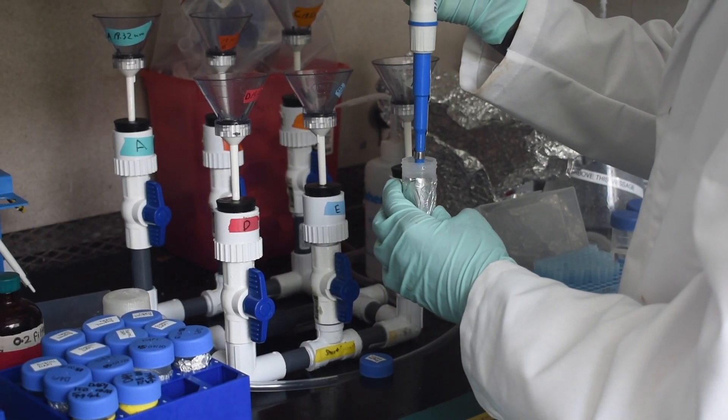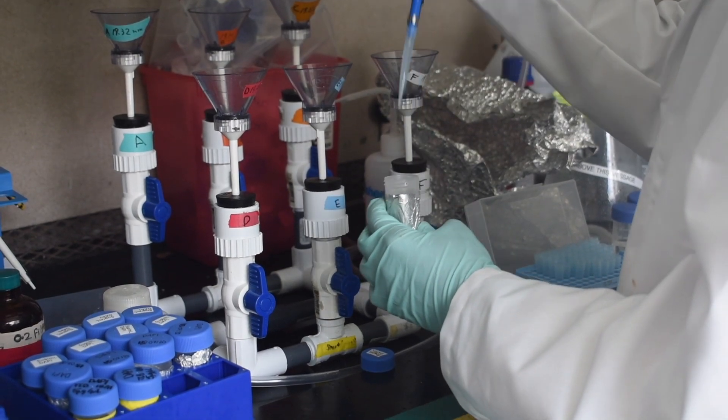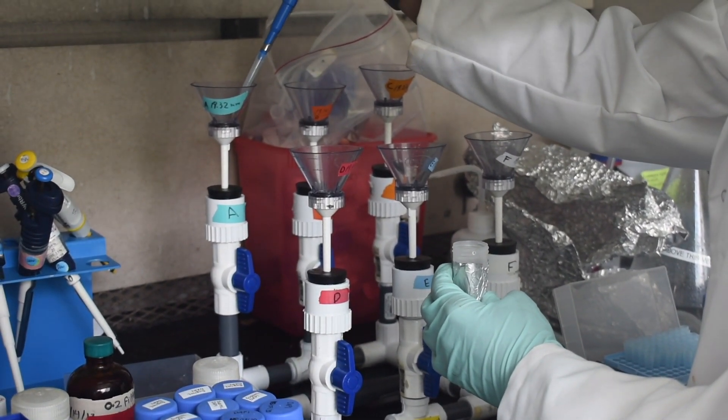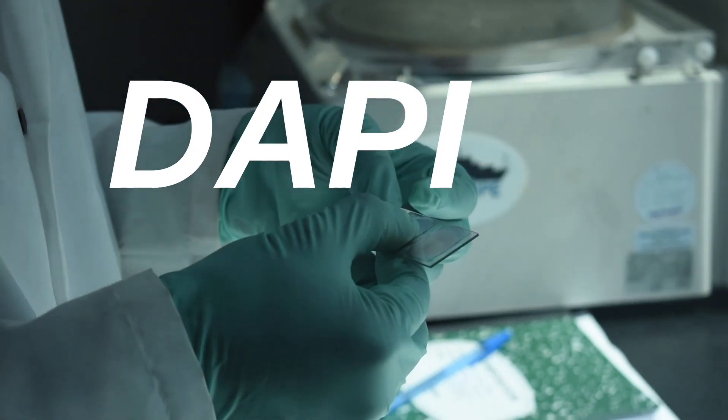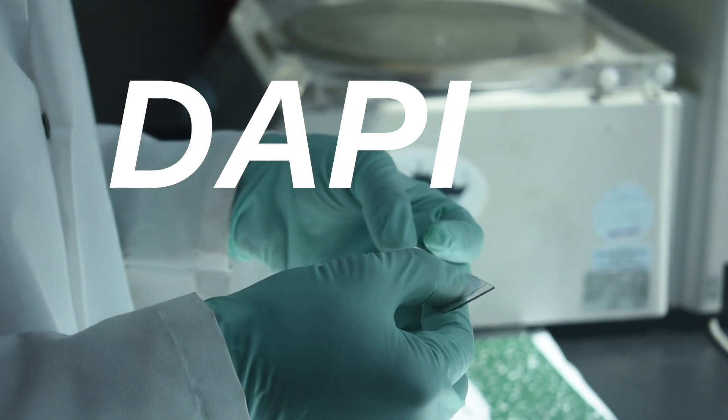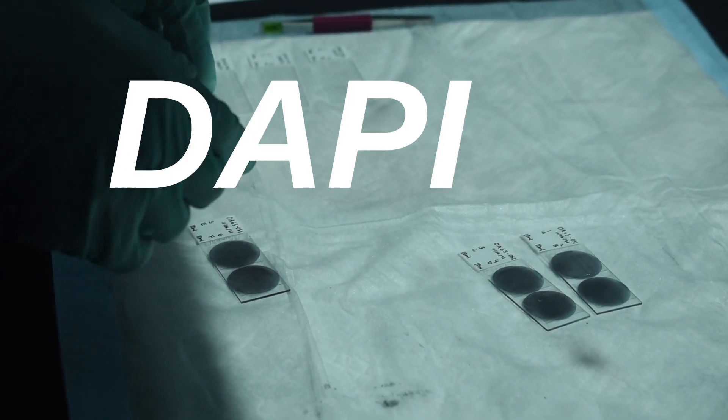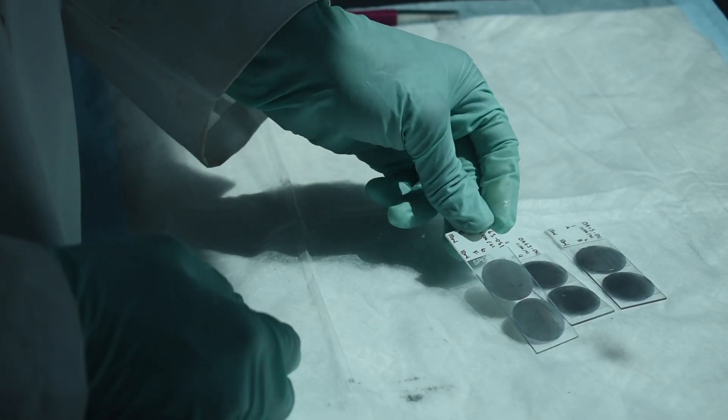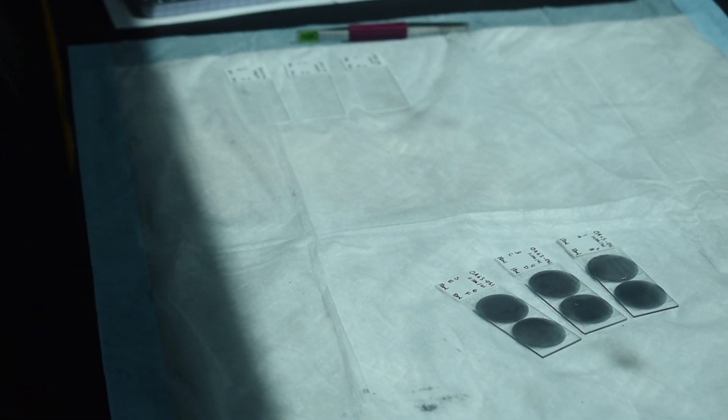This protocol is used for enumerating bacteria on the microscope and we use a stain called DAPI which binds to the DNA of the bacteria and it fluoresces under UV light, a kind of white or pale blue color.